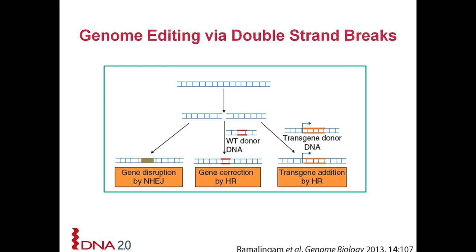since if it's as high as 50% of the time that you get indels, or even 10%, as long as you're willing to screen 10 or 20 colonies, you'll find something that's a positive. So it's fairly efficient without the need for markers.